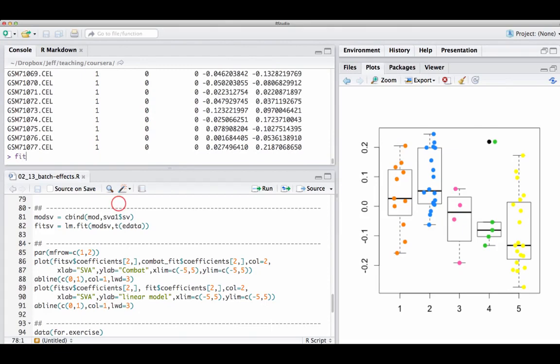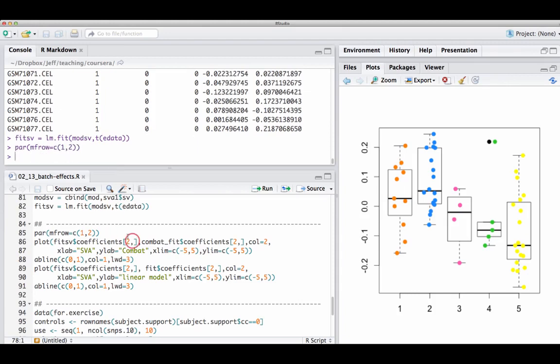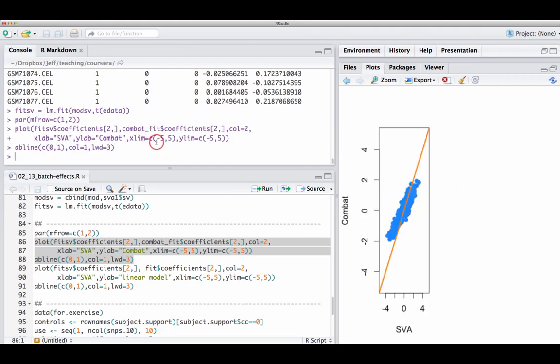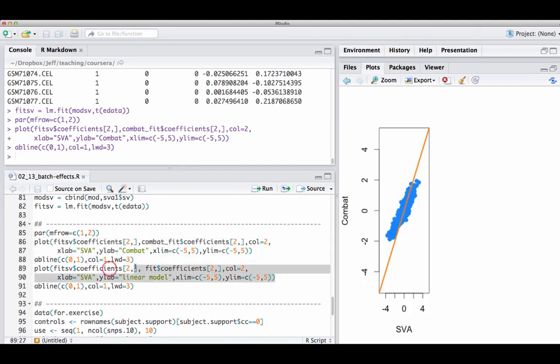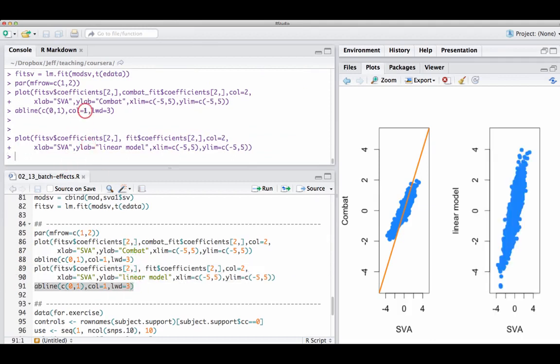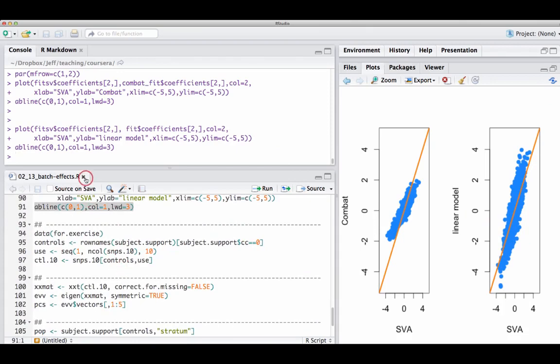I can use lm.fit or any of the other methods from the previous lecture to get the model fit after adjusting for those variables. Comparing SVA to ComBat — with SVA on the X axis and ComBat on the Y axis — the two are actually pretty highly correlated. Comparing SVA to the plain linear model adjustment without ComBat, the values aren't shrunken and are even a bit more correlated. That's basically how you run SVA on a data set to infer batch effects when you don't know what they are.